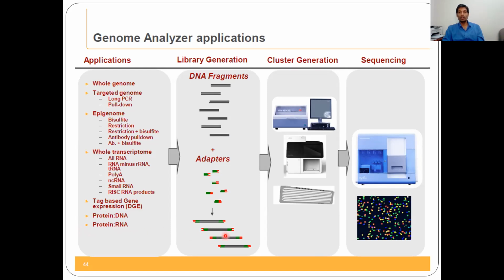Only in the last few years has this actually developed, and we are discovering a lot of information. The information is very huge, because with this sequencing we are getting GB of data.